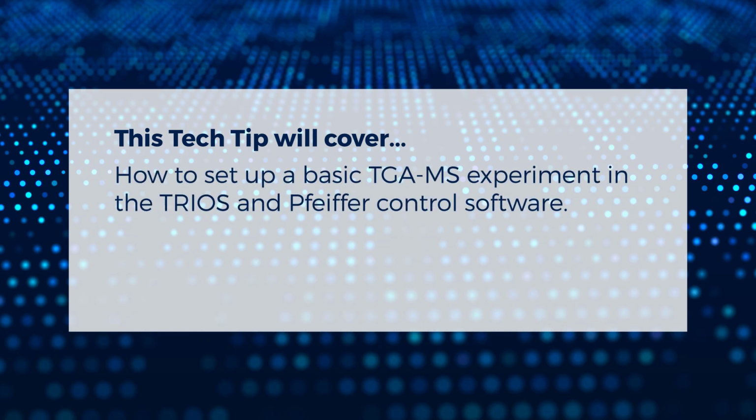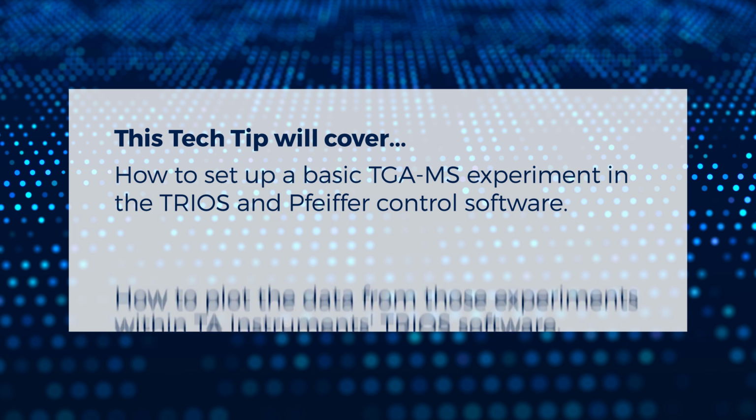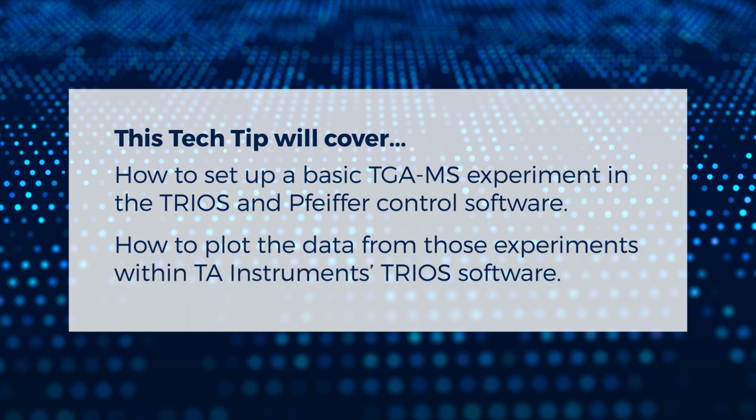In this tech tip, we will demonstrate how to set up a TGA mass spectrometry experiment on a Discovery TGA connected to a Pfeiffer Thermostar mass spectrometer. This video will cover how to set up a basic TGA-MS experiment in the Trios and Pfeiffer control software. We'll also provide tips on how you might plot the data from those experiments within TA Instruments' Trios software.